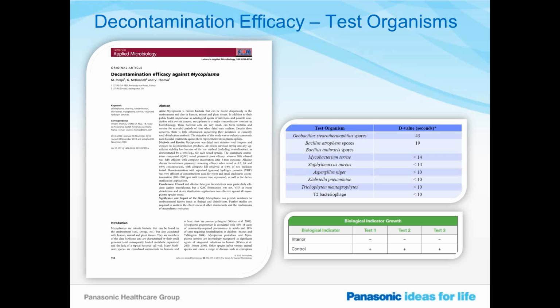And I think this is a point I revisited from the last webinar: regardless of which decontamination technology you choose or prefer, what really should be focused on when you're looking at the technical papers or white papers for these types of technologies for efficacy is to make sure to look at the organisms that have been tested.